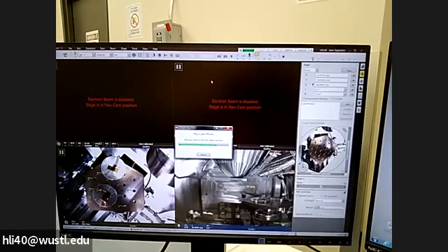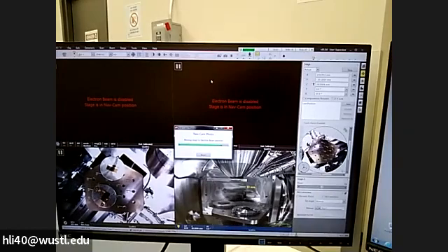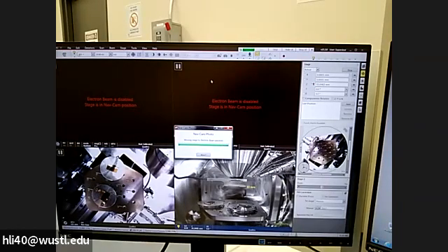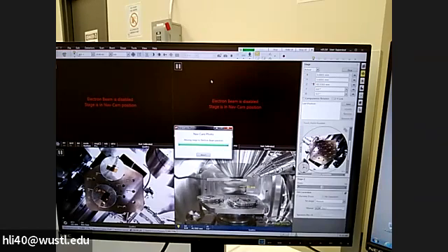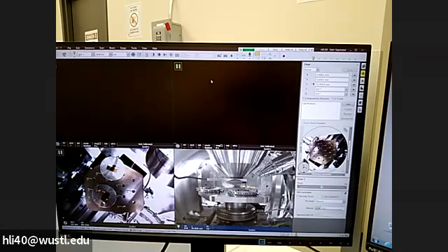After you take the navigation photo, it's supposed to come back to the original place before we clicked the take navigation photo button. If not, let us know. A lot of times it's a software issue.